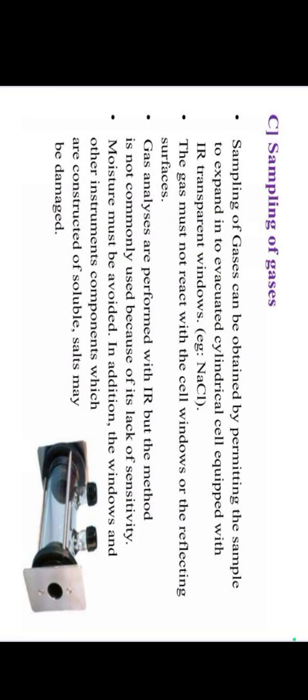The third sample handling is sampling of gases. Gas samples can be obtained by permitting the sample to expand into an evacuated cylindrical cell equipped with IR transparent windows. The gases must not react with the cell windows. Gas analysis is performed with IR, but the method is not commonly used because of lack of sensitivity.